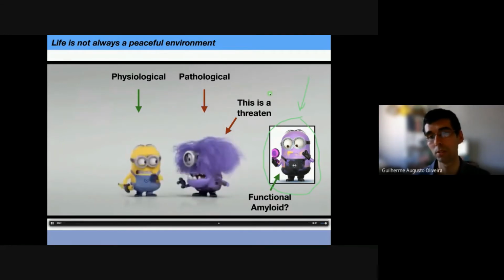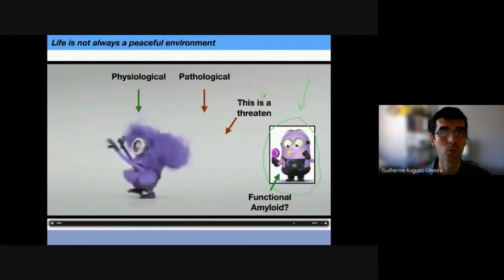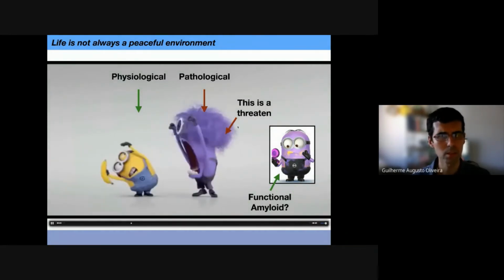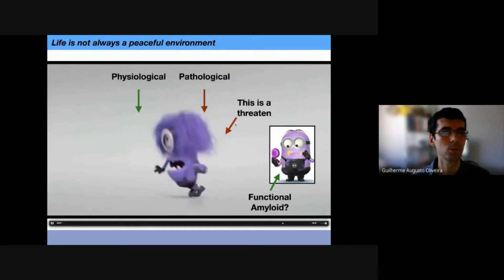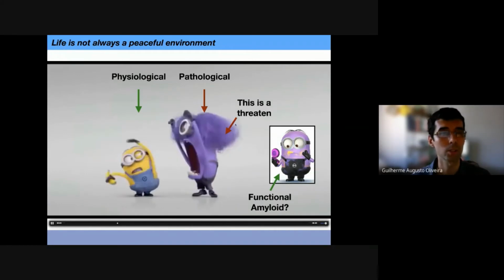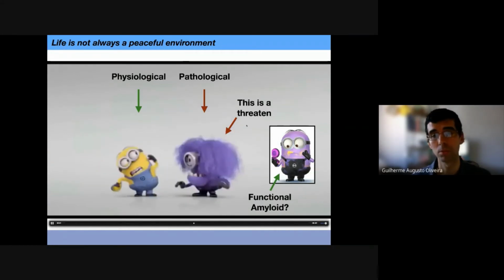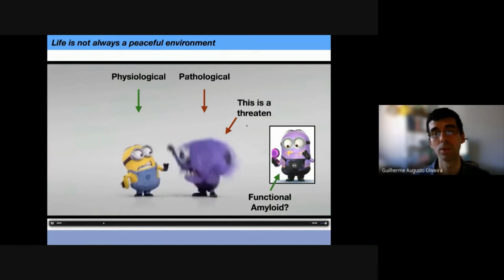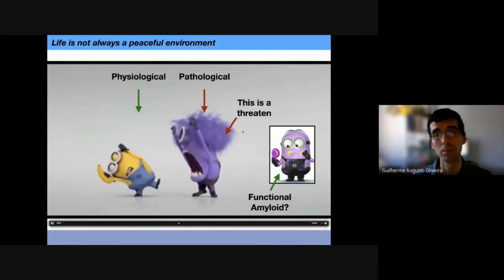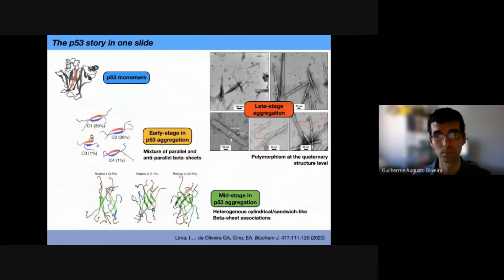But they are really doing a nice work for the cells, and they have a physiological role. They don't have this pathological role. And I think this is a cool slide to represent the concept, to introduce the concept of amyloidogenic proteins. So these are proteins undergoing some specific transformations and becoming very toxic to the cell.